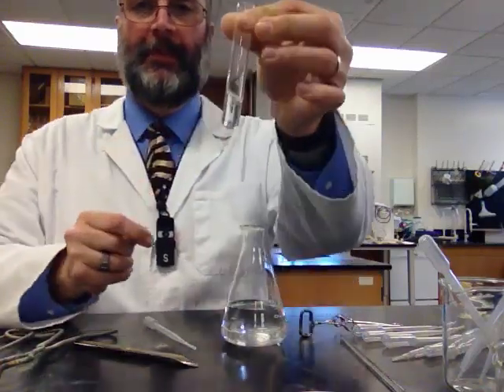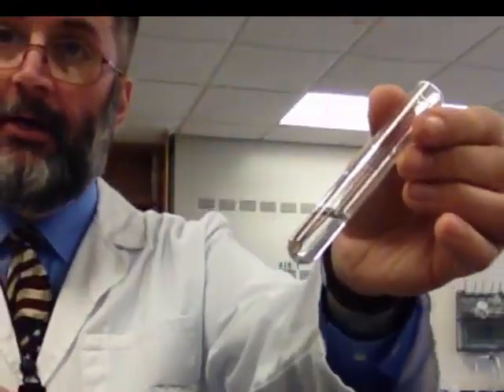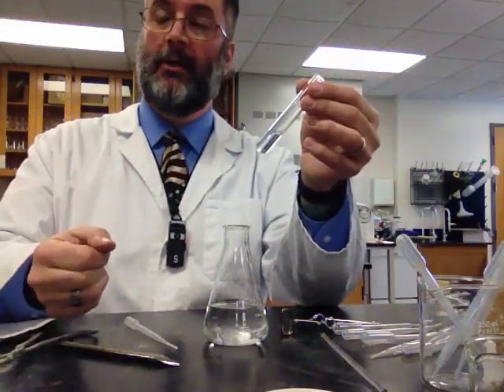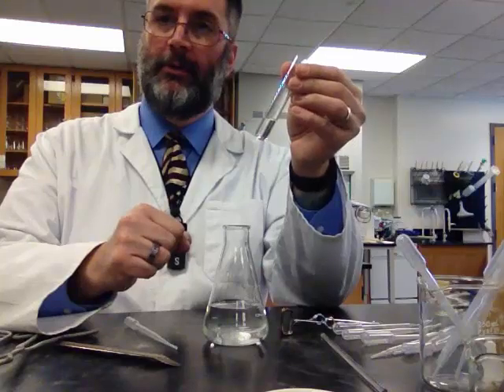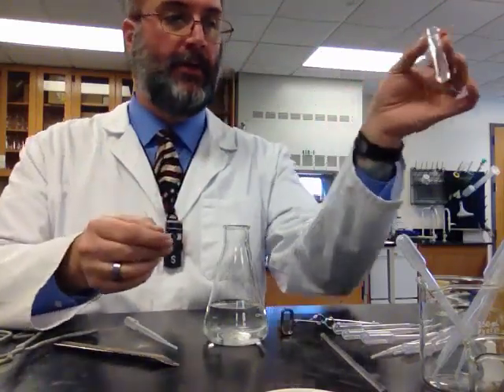All right. What happened to our crystals? They're gone. What happened? You can make an observation. The crystals aren't there anymore. You can also probably make an inference. What inference would you make based on that observation? There's a change. Crystals were there, now they're not there.